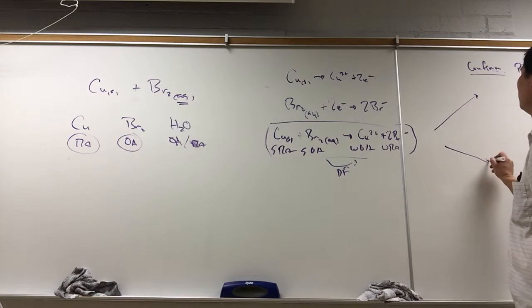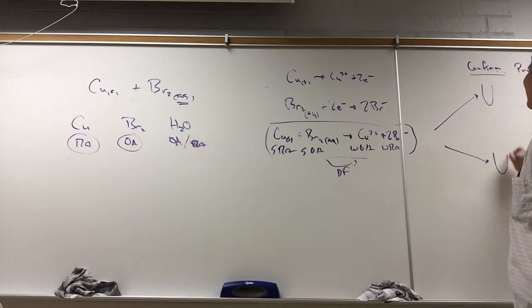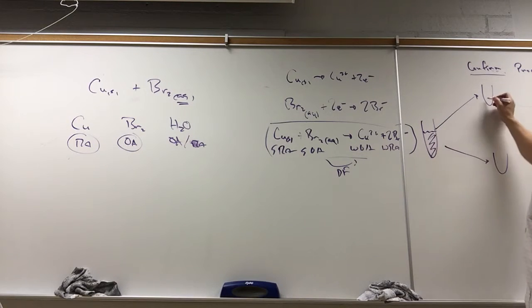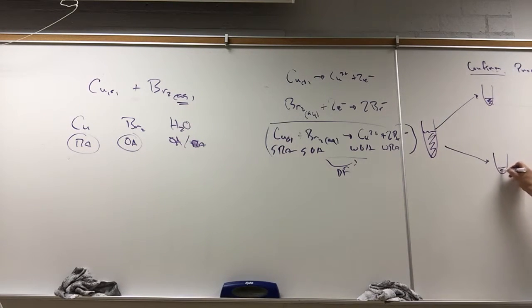We split it up into 2 test tubes. And so half of it goes here, the other half goes here. One test tube, we test for the presence of copper 2. And so we have a copper 2 ion test. The copper 2 ion test is, we're going to use a reaction that's very well known. It's a Lewis acid-base reaction.